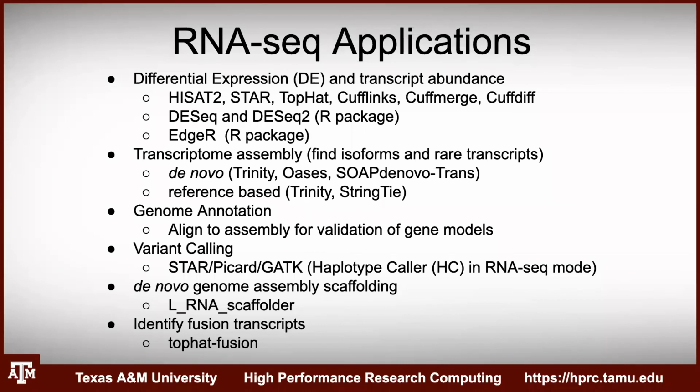Top Hat is one that a lot of people still use. The author of Top Hat is actually the author of HiSat, and he begs people to stop using Top Hat. It's deprecated. It's old. It's not as efficient as HiSat, but it's still really commonly used. It gained a lot of popularity, and diehards have yet to migrate over to HiSat2.